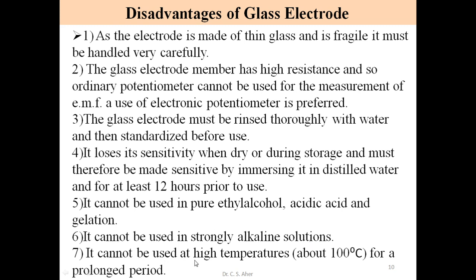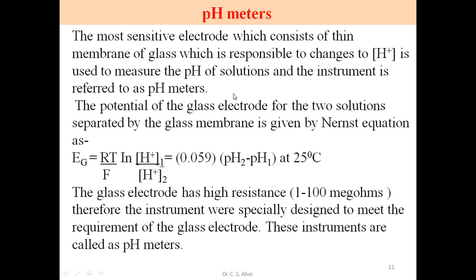It cannot be used at high temperature above 100 degrees centigrade for a prolonged period. So these are the disadvantages of glass electrode. Still, it is very useful.